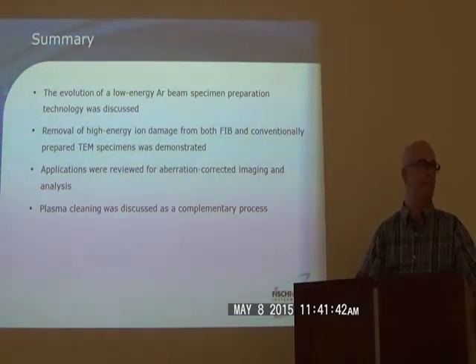So the samples, what could be achieved on Pico and on NanoMill, they will be a little bit different for the slice or size thicknesses, right? It's more for the ability to image it while it's in the mill itself. The ion source, that's going to be more of a question for sales and marketing, whether the ion source in both systems will be the same.